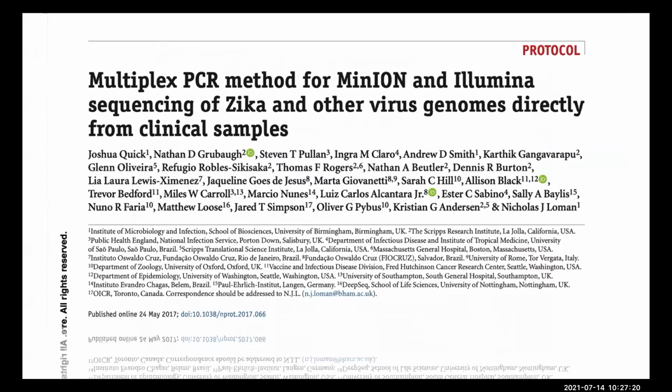And we came up with this approach back in 2016-2017 during the Zika outbreak, and we were trying to sequence a very large number of very difficult to sequence samples of Zika virus. And we came up with the approach of using multiplex PCR, which is based on similar approaches that were already in existence at the time, like for example Thermo Ampliseq. But all the primers and everything were designed from scratch, and the processes were designed again using open source components.